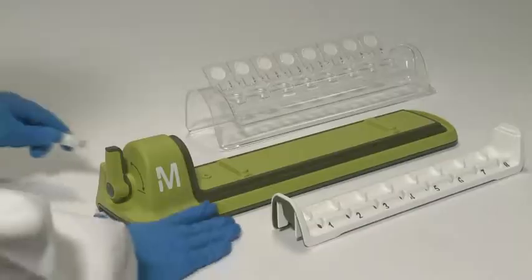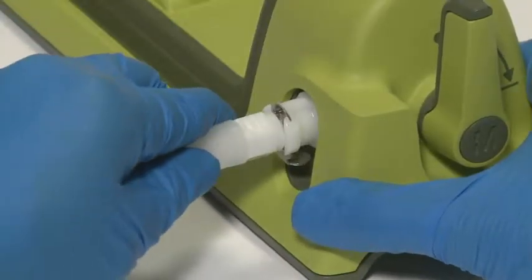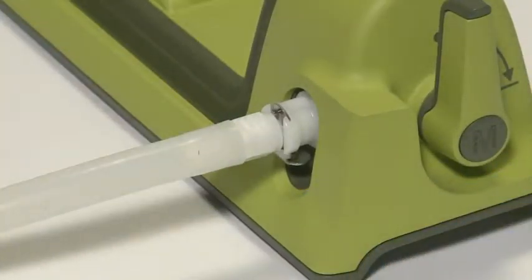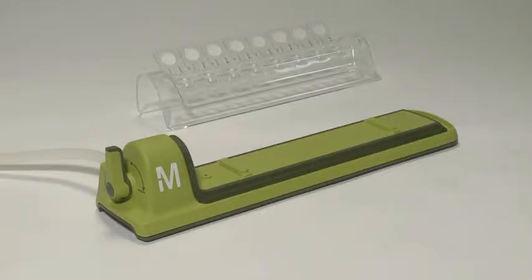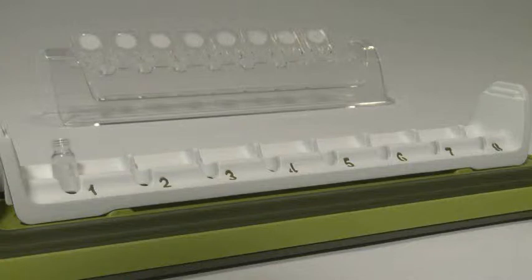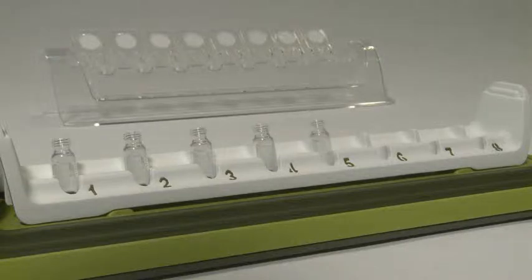Your first step is to connect the system to a vacuum pump or house vacuum using the connection tube provided. Once the vial tray has been placed into the base of the unit, you can load your vials. The system can accommodate most standard 12 by 32 millimeter HPLC vials.